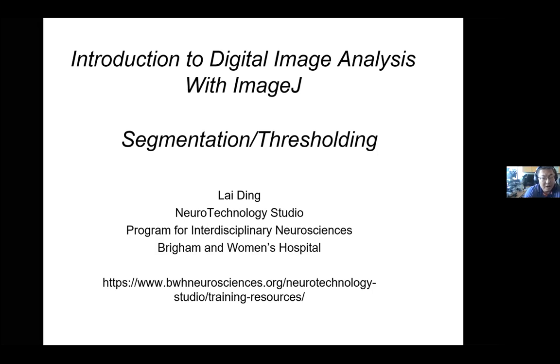And as we mentioned in the previous webinars, thresholding is basically the centerpiece of our digital image analysis, not just for ImageJ. Okay? For any other image analysis software, in the end, whether your analysis is successful or not basically falls on how well you can do the thresholding. So today we're just using more examples to talk about how to achieve this goal.